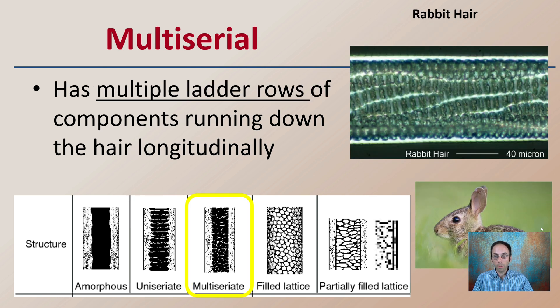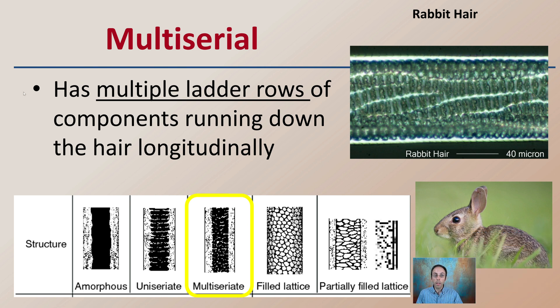The multi-serial medulla has multiple ladder rows of components running down the hair in the longitudinal direction. Rabbit hair is an example that falls under this category, and we can see that evident here at the same magnification of 40 microns.